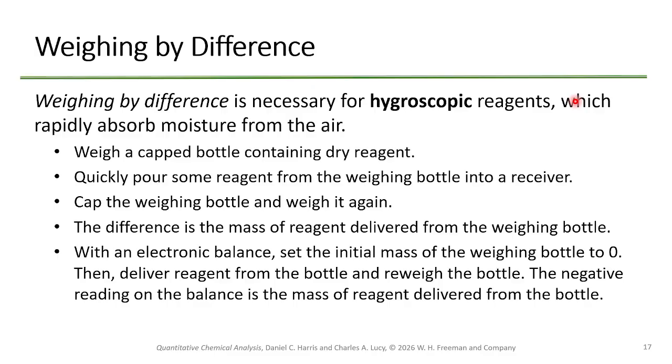So we just make up 50% solutions for you and give that to you. But if you take solid sodium hydroxide and put it in a weighing boat and then go clean something and come back, what you would see is it would actually have droplets of water on it. Okay, and it would partially solvate. Some of it would actually dissolve, right? That's because it's actually quite hygroscopic. Is it the most hygroscopic thing? No, there's more hygroscopic stuff that is even worse.